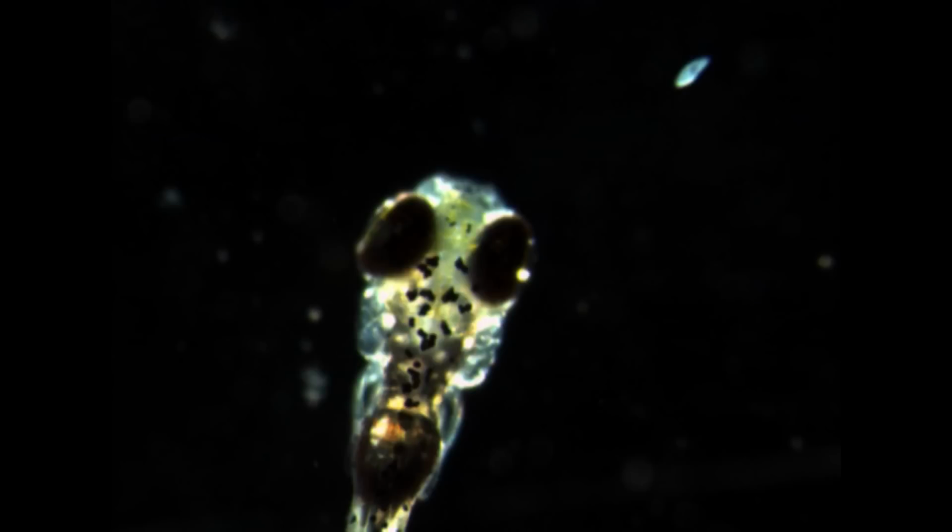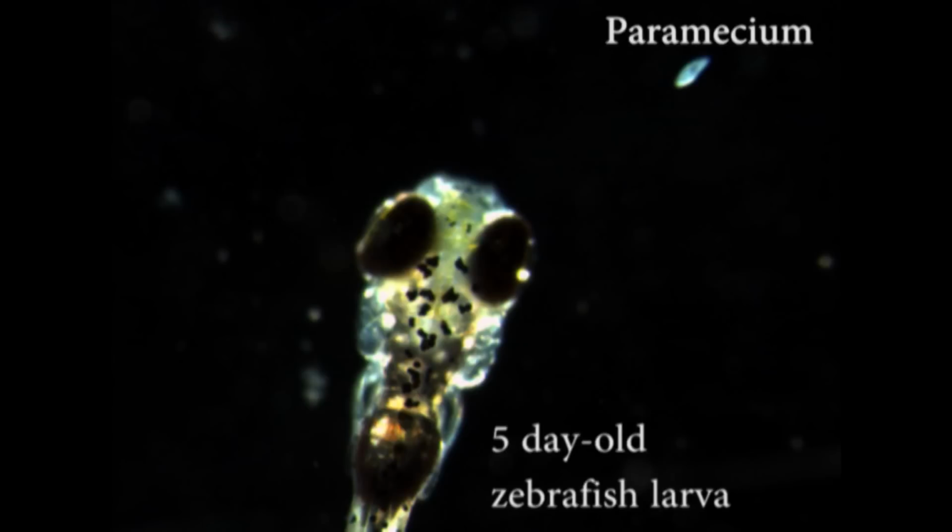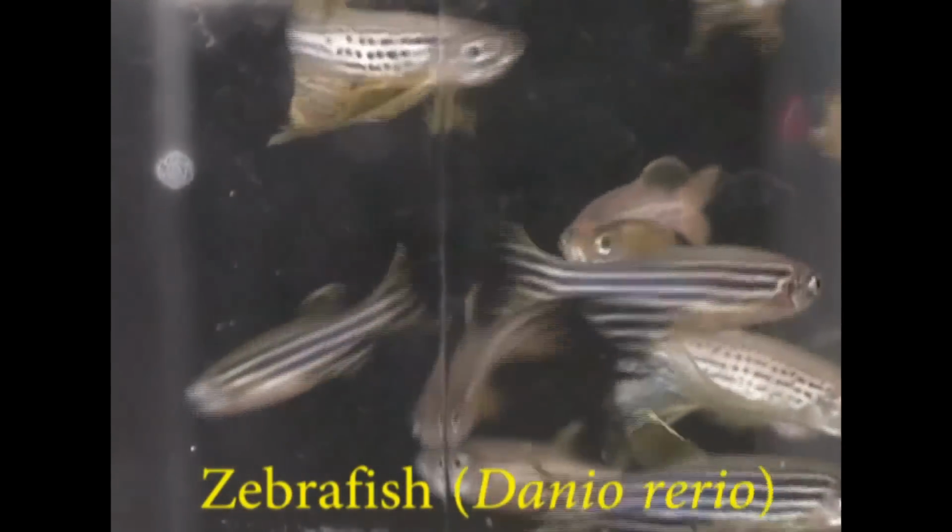We want to know how the brain works during perception and behaviors. Zebrafish larvae can recognize a paramecium at 5 days post-fertilization. The fish finds the paramecium, approaches the paramecium, and catches it. We aimed to visualize the brain activity during perception of a paramecium. In order to make this possible, we developed tools and methods in the model vertebrate zebrafish.